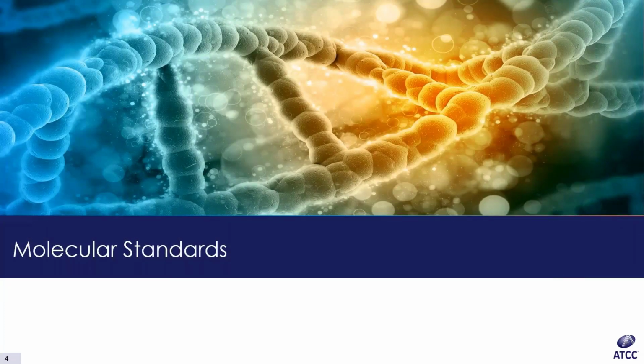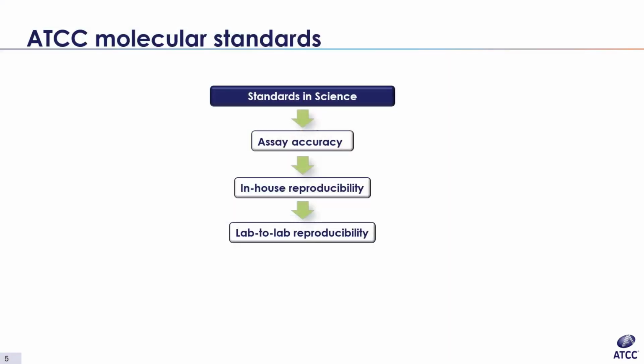Let's begin with the basic importance of molecular standards. We all value having a ruler because having a standard measurement allows comparison. Molecular biology is just the same. We need a standard to compare our results or to make claims about our assay. The importance here is emphasized because of the growing use of nucleic acid amplification tests in diagnostic and surveillance assays, and in research too. Even with this increasing stature of next generation sequencing, targeted assays are still important for applications where you need to find the needle in the haystack.